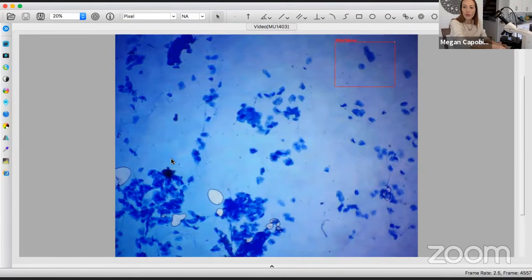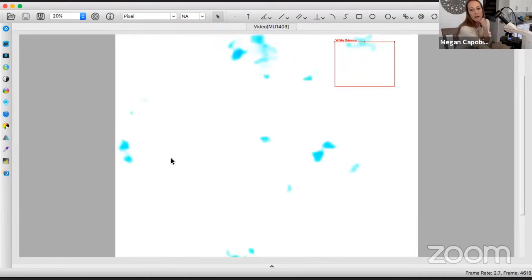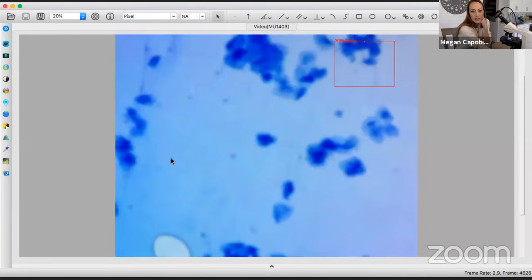Now, before I was telling you, make sure that you tap down your cheek cells onto the slide. The reason for that is if you scrape them off, you can actually roll up your cells and they'll be like little burritos and you won't be able to see them that well. So that's why it's important to tap them down onto the slide. Let's take a closer look at this one. Give it a moment to adjust. I'm going to focus in a little bit more.